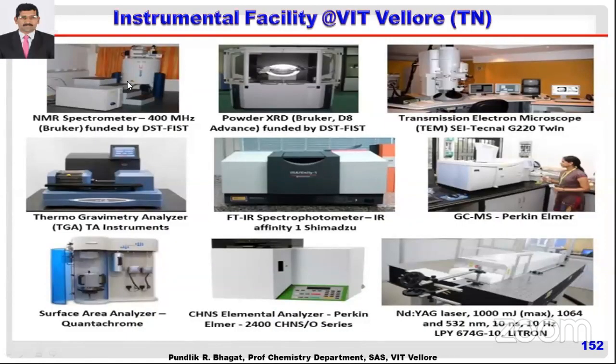I was the in-charge here. These two instruments, NMR, I settled, even though I was not doing anything. NMR and another instrument, GCMS, which is shown on the next page. Powder XRD, and we have two transmission electron microscopes. Previously we were getting tea coffee coupons, including research scholars. But the last time our VC requested everybody that we stop your tea coffee and accumulate the fund. See the beauty of this transmission electron microscope.